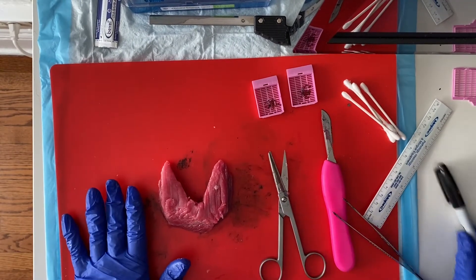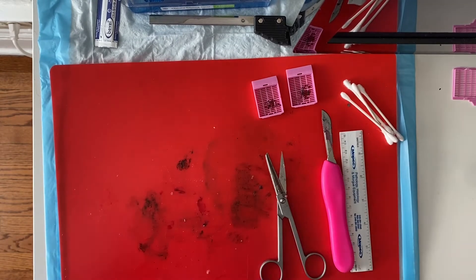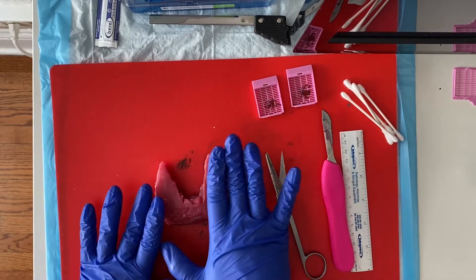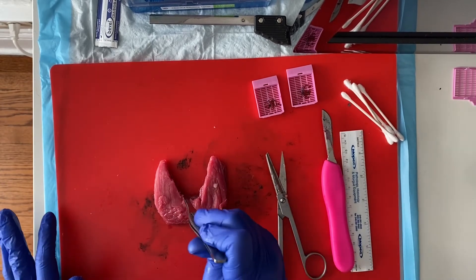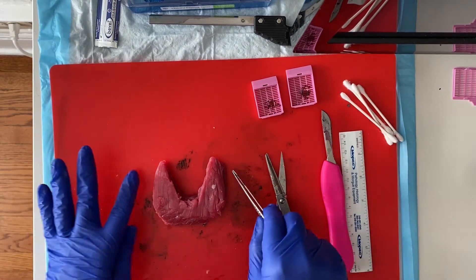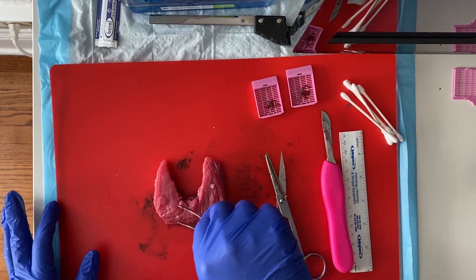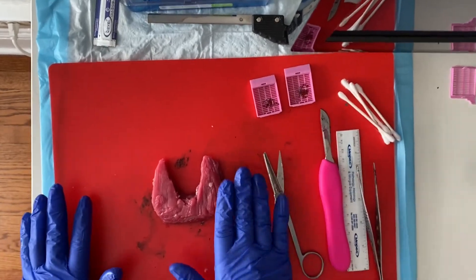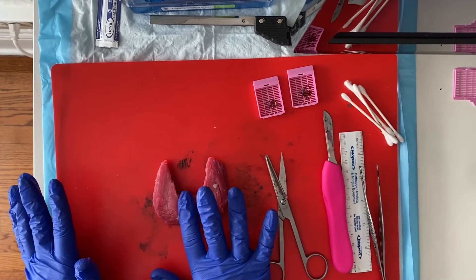Now we have our total thyroid. I'm orienting it with the posterior side facing up. This would be my right lobe, my left lobe, and my isthmus. I don't have a pyramidal lobe — if I did, it would be right here. Our lobes taper superiorly and our isthmus is usually on the inferior aspect. I'm going to ink these: my right lobe one color, my left lobe one color, and my isthmus a third color.